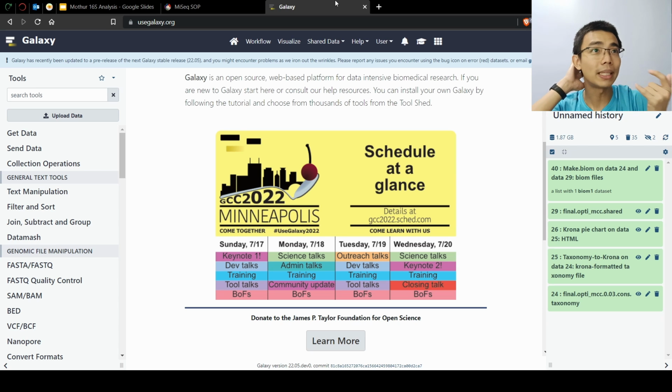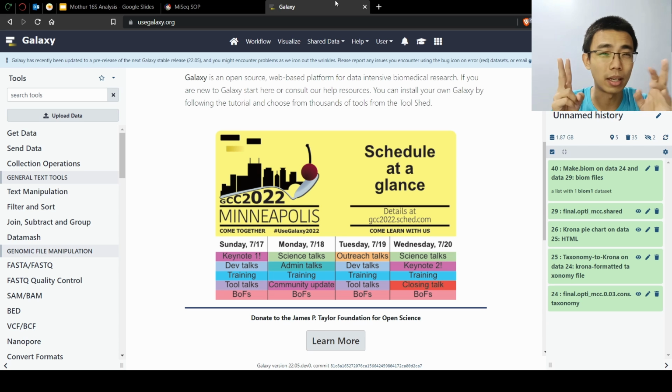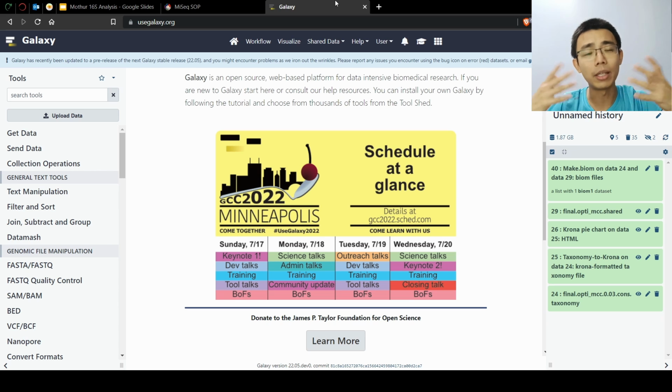So basically, so far what we have is all the tables, and we can also see the relationship between our samples using PCA, the principal component analysis, and we have also done a little bit of ggtree with the phylogenetic relationship. But those are all relationships between samples. The taxonomy information is not very clear. So this is supposed to help us understand that.